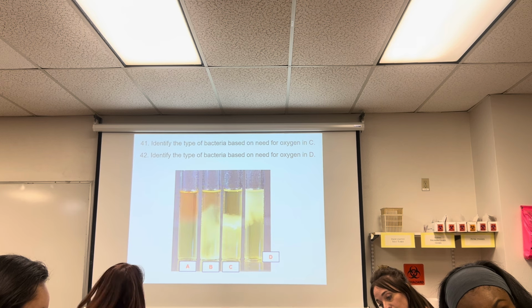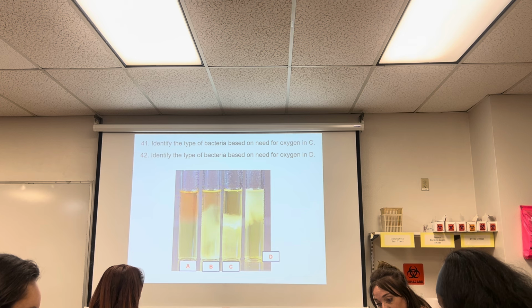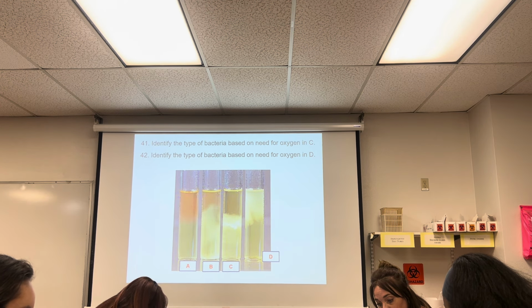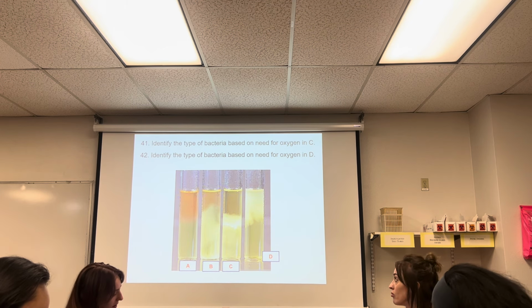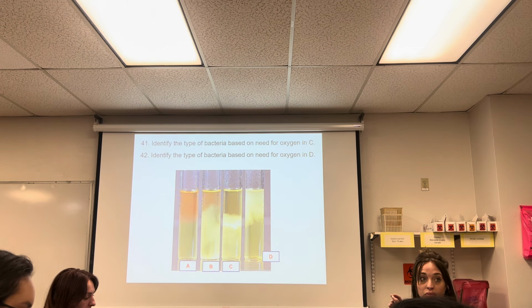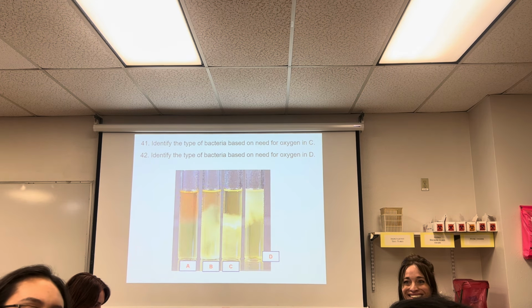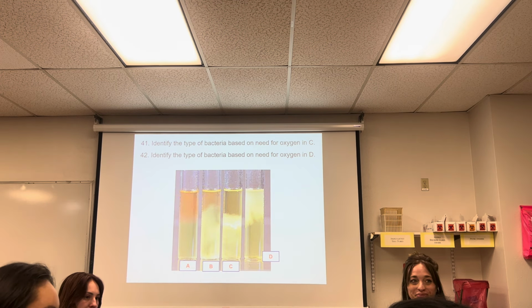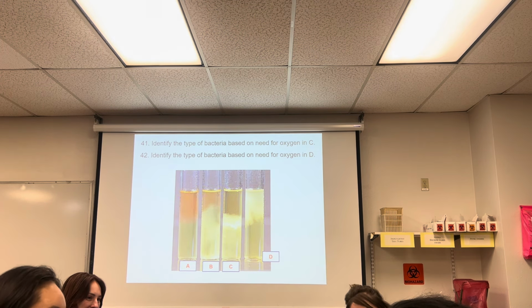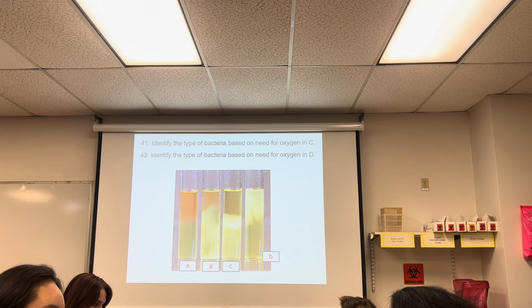So 10% of the questions, so that's 5 or 6, are gonna be about safety and lab management. So if I ask, where do you put plates after you're done with them so they can be destroyed? You can't just throw them away. The red biohazard bag. I would rather you say biohazard bag. If you say red bag and somebody has a red bag that day, I'm gonna get all confused. Okay? What if I say, what's a permissive temperature?